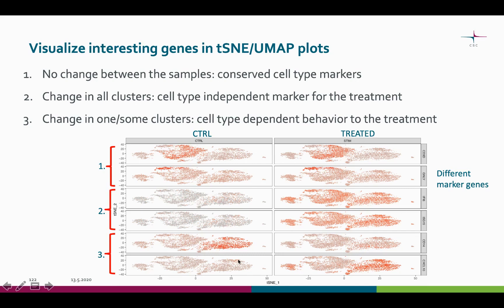In the last scenario, we see cell type dependent reaction to the treatment. This gene is active in this cluster in the control sample, but not in the treated sample.